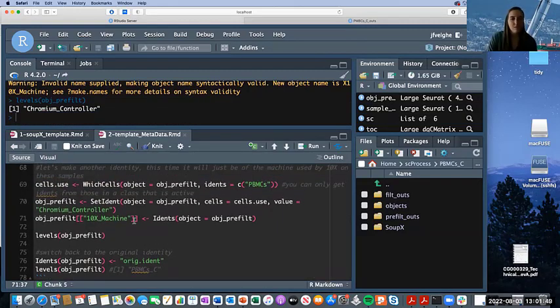So what other kinds of errors can you get? It's a warning, so it sounds like it's saying please don't do this, but we'll let you. It's like an FYI. You might find down the line that things might not work, but I don't think I can go over all the types of warnings you can get. There are many, and this is your first warning. Don't worry, you'll get warnings. It's the errors that will cause something to fail. The warnings can be ignored. Well, I wouldn't say totally ignore it. I would say read it, interpret it, and know what it's saying. And it's not changing anything.